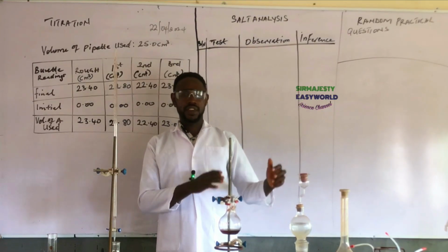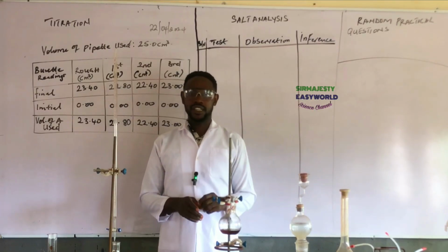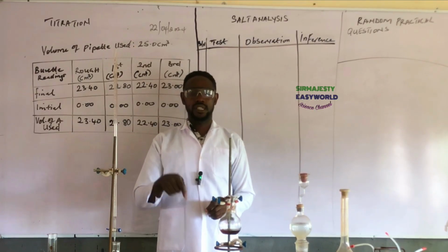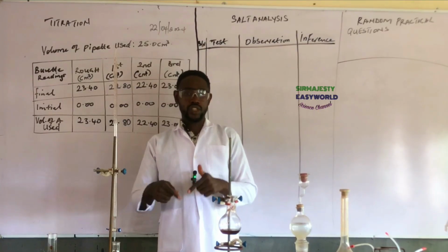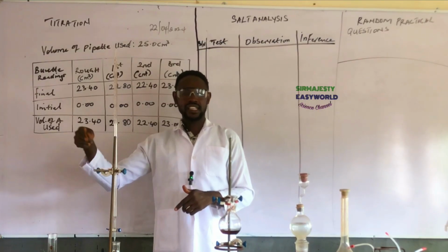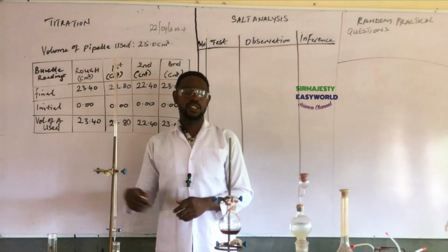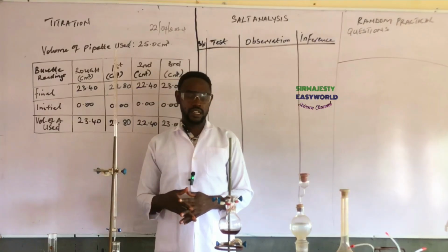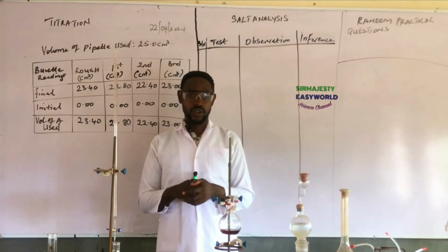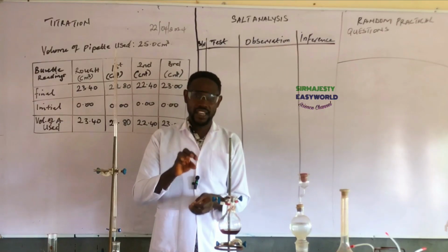For alternative A, their acid is labeled A, their base is labeled B, their salt is labeled C. If they have 2 salts, it will be C and D. Such that alternative B now, their acid will be labeled, after D it is E, their acid will be labeled E, and their base will be labeled F for alternative B candidate. So that letter A doesn't necessarily mean acid. It is just a way of identifying specimen.